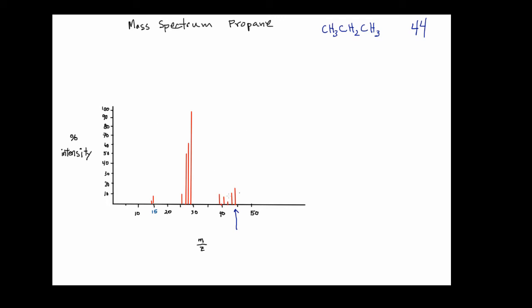I took this scan from real data, and then I just rewrote it here on the video. So you can see right here, this peak, that this is molar mass of 44. So this peak right here represents our molecular ion, which is representative of the total mass of the compound, and specifically it will be this molecular ion. So the molecule in total is missing one electron. All right. The next peak in we see is at 43. All right, let me just draw an arrow down.